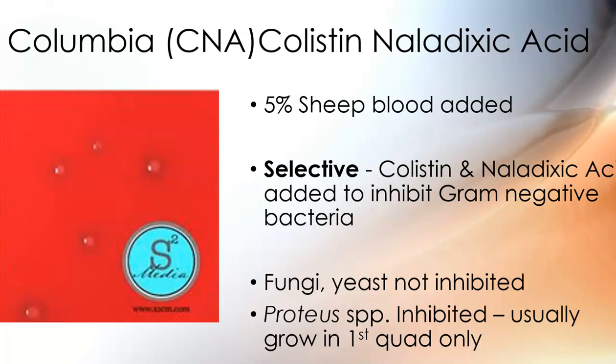And remember, you need more than just 1 to 3 colonies to consider it growing in that quadrant.